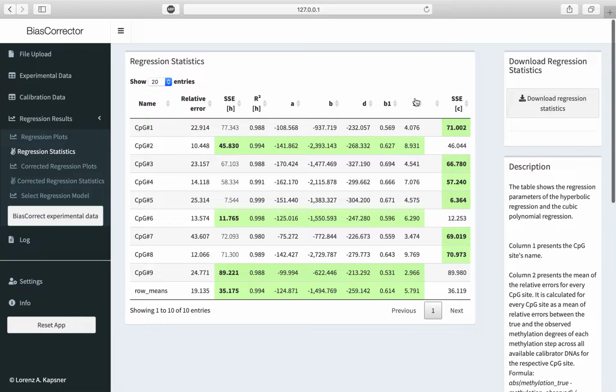Parameter S, which is summarized bias or total bias, comprises, in addition to PCR bias, other experimental deviations. It approximates 0 in case of no bias. In our example of E-cadherin gene, experimental biases are rather moderate, that is reflected, for example, in the values of B1 of approximately 0.5 to 0.6.